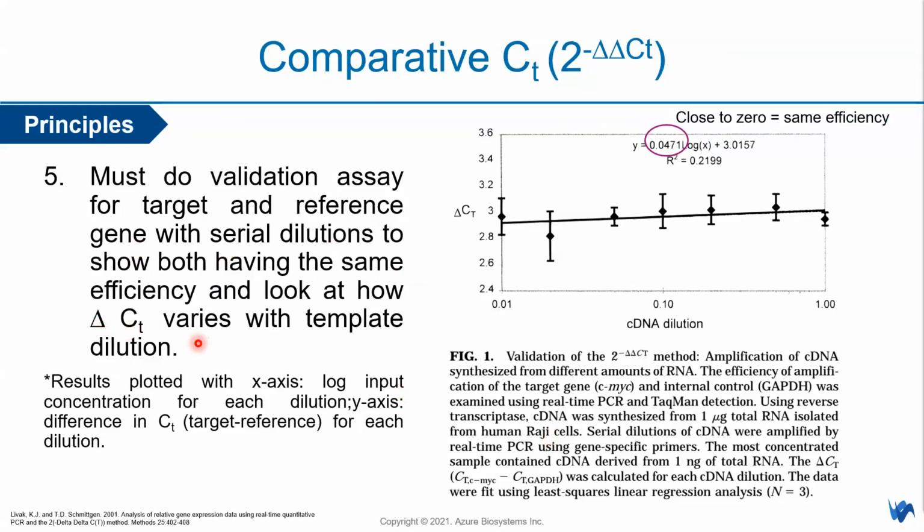How you do that is you have your same standard, you go through your qPCR run, you get your CQ value, then you plot the result.